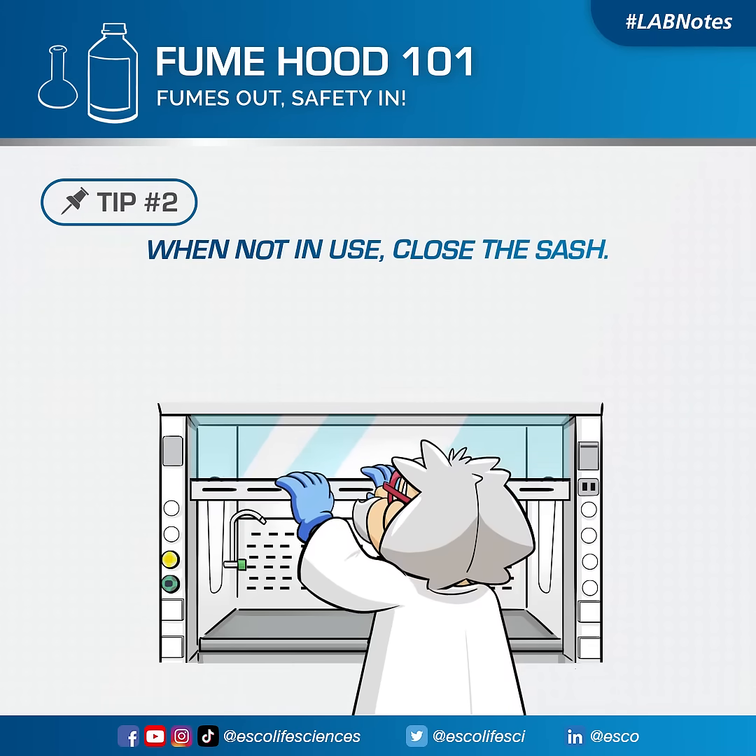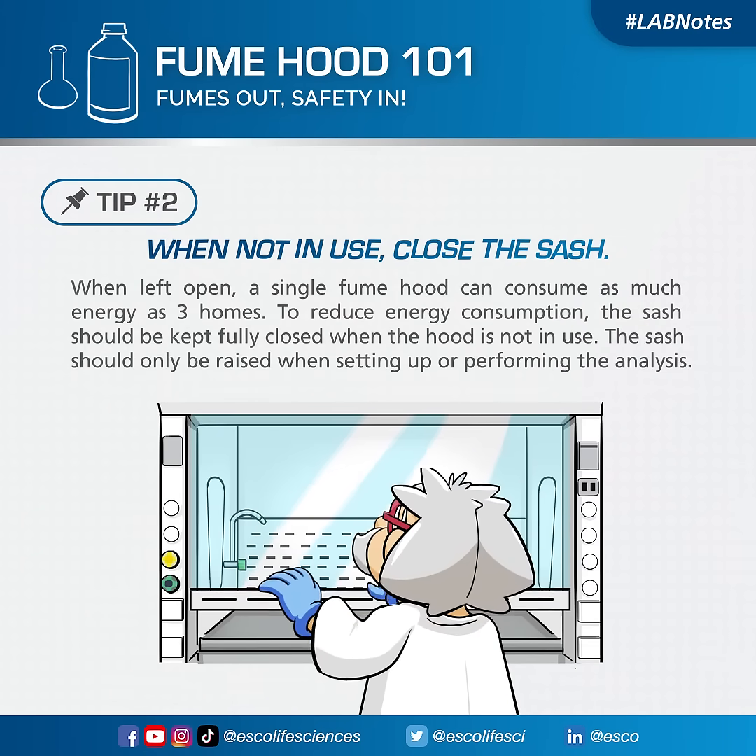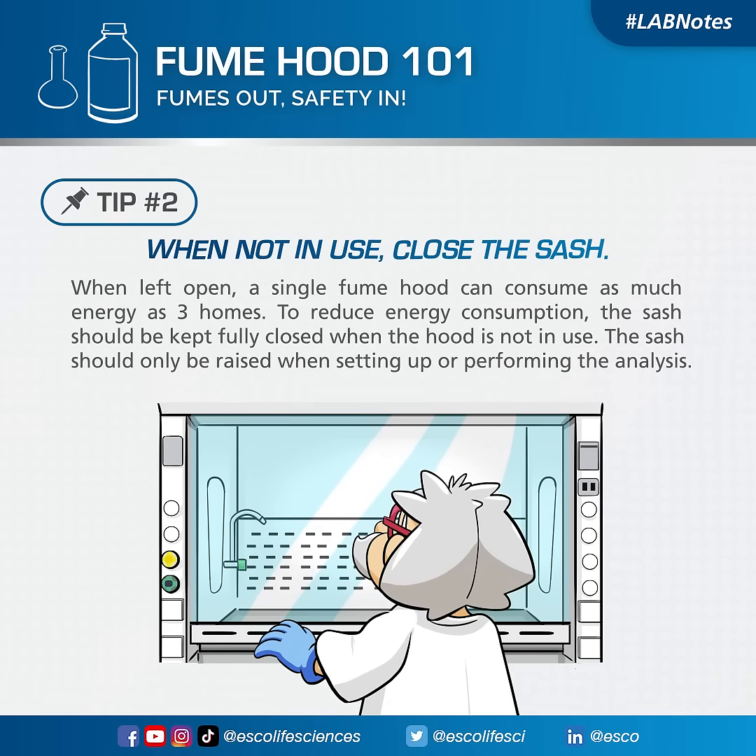When not in use, close the sash. When left open, a single fumehood can consume as much energy as three homes. To reduce energy consumption, the sash should be kept fully closed when the hood is not in use. The sash should only be raised when setting up or performing the analysis.